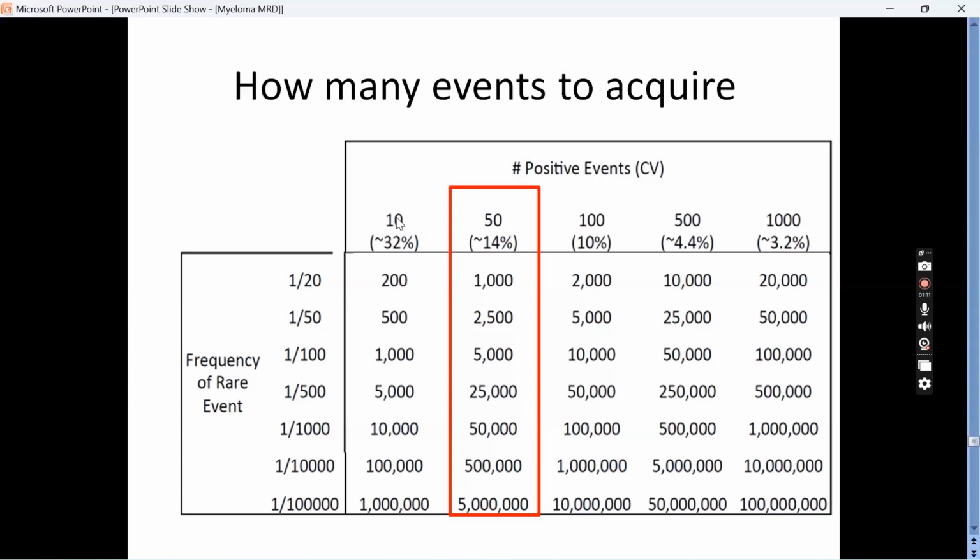If you run this assay, if you kept it as 10 events, when you acquire that particular tube, those 10 events are there. If you reacquire that same tube, there is a chance you will not get the same 10 events. You may get this time 8 events or 12, 13 events. So it is not precise or reproducible. So the CV will be very high.